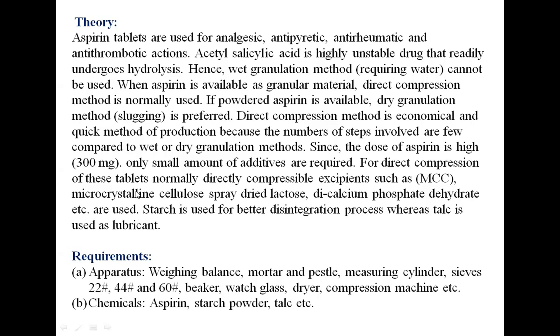The requirements to perform this experiment are apparatus: weighing balance, mortar and pestle, measuring cylinder, sieves number 22, 44, and 60, beaker, watch glass, a hot air dryer, and a compression machine. The chemicals we require are aspirin, starch powder, and talc, which we have already seen.